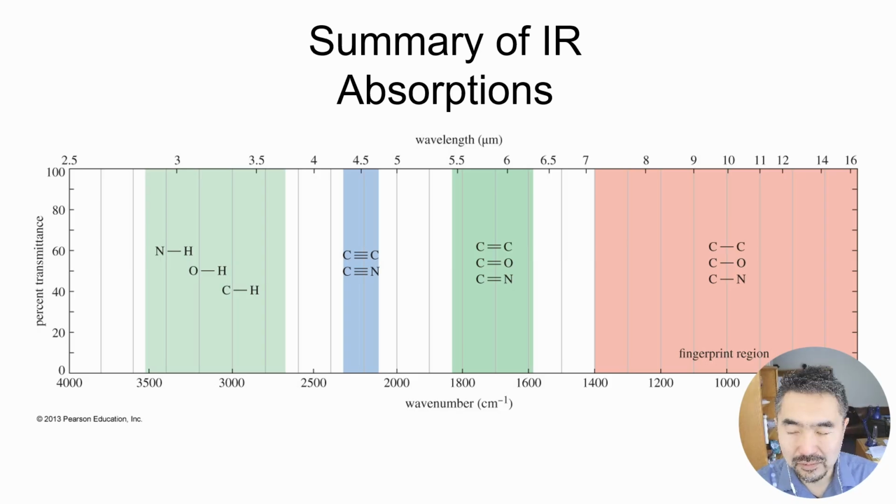I forget how many, but the point of this video is that we're going to look at individual, specific, real-life IR spectra and see if we can make sense of them. When we say we make sense of them, we're going to assign each functional group, or specifically each chemical bond, to each band or peak that we see.